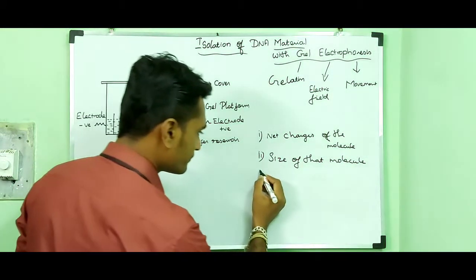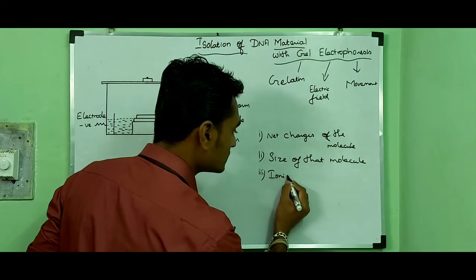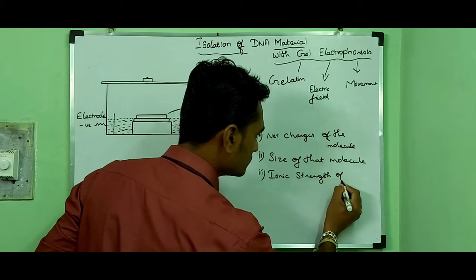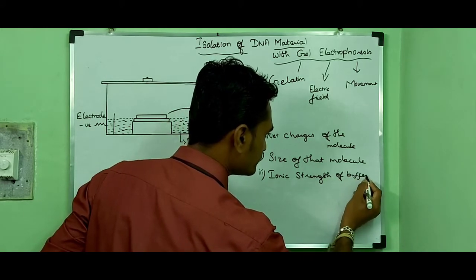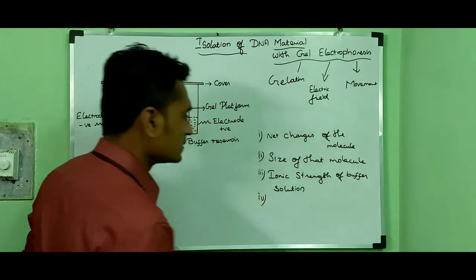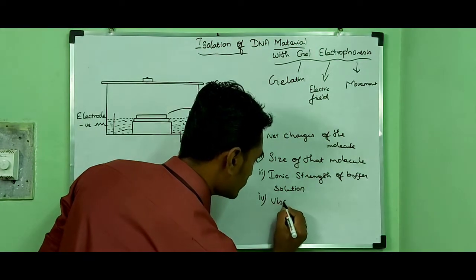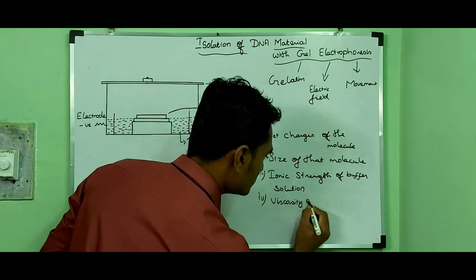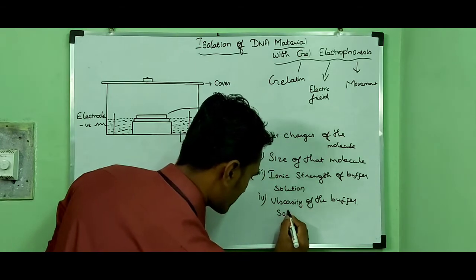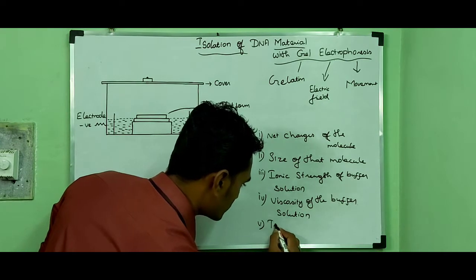In addition, it depends upon the ionic strength of the buffer solution. Then the fourth point, it depends upon the viscosity of the buffer solution.